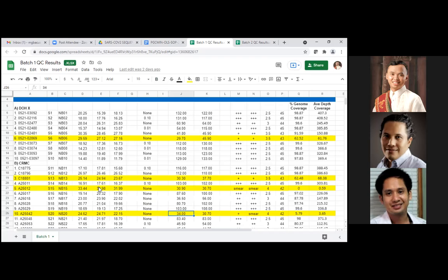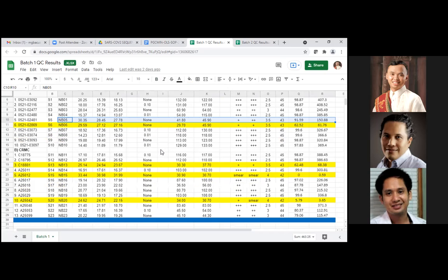But interestingly, other samples with much higher CT values, like this one, we were able to successfully amplify. So there's really a variation; sometimes there are stochastic processes which are difficult to predict and which could affect the samples during the processing. So we always expect that we will get some unexpected results. Like here 26, but still we had higher or better results compared to this one, which has lower CT values, which corresponds to more viral RNA concentration, but we did not get the expected result.